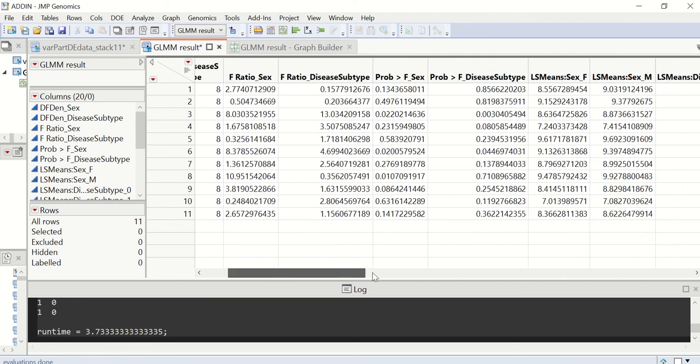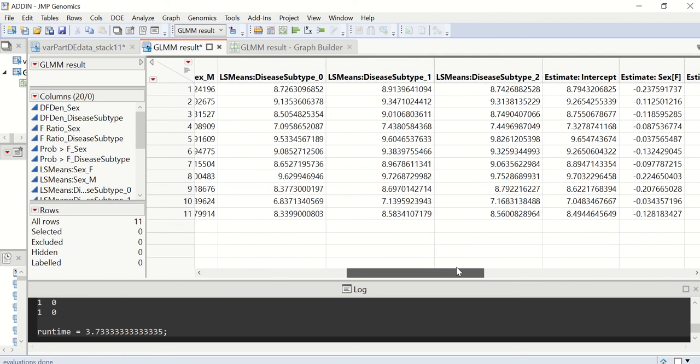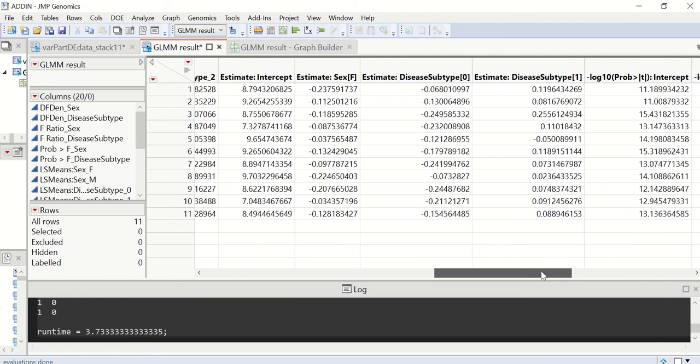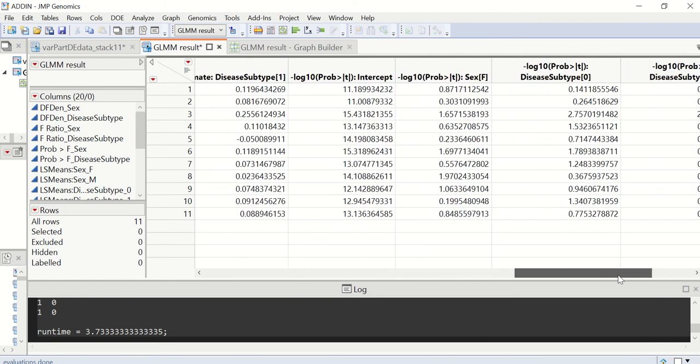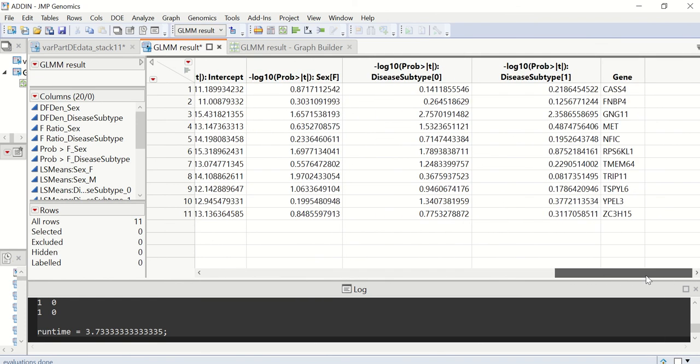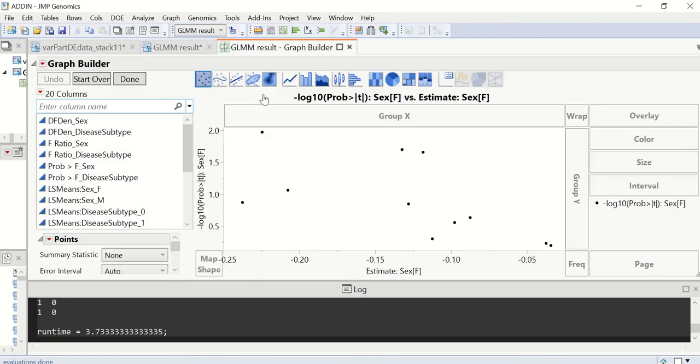Here, we can see the key results from the reports that are generated for each gene in this table.